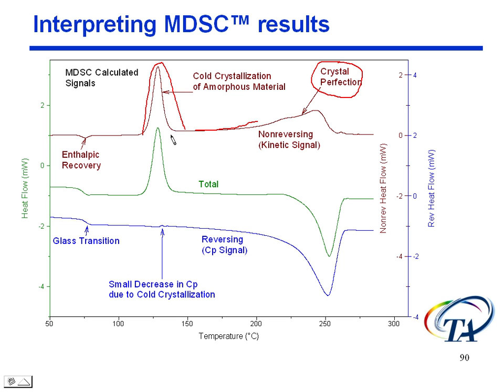Now what's happening is we have crystals melting here, and they're recrystallizing there. Melting here, recrystallizing there. And that continues until at some point all of these crystals finish crystallizing and then they all melt. And that's when we see the finish of this.